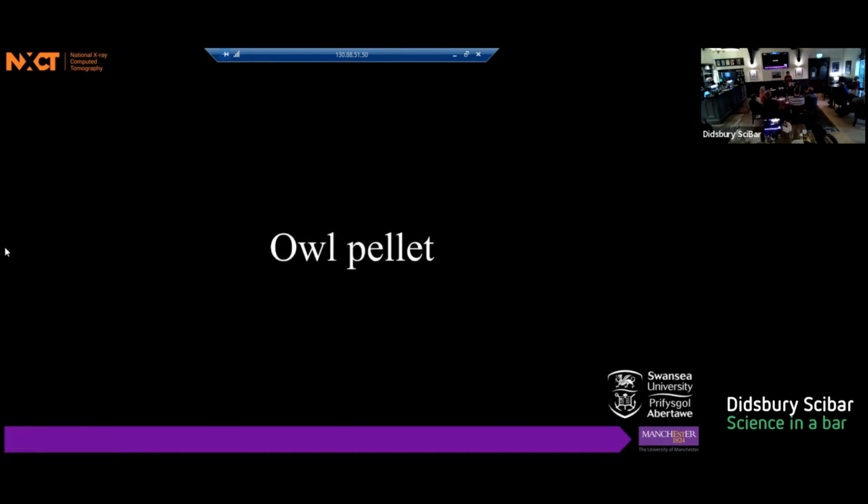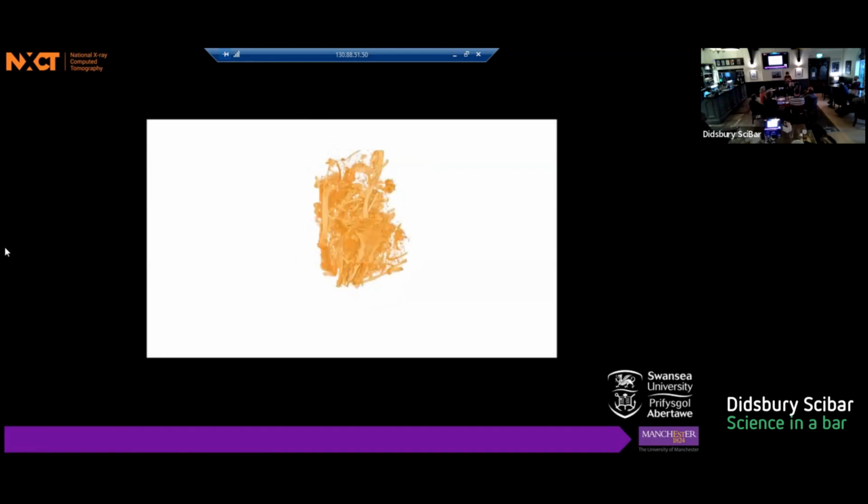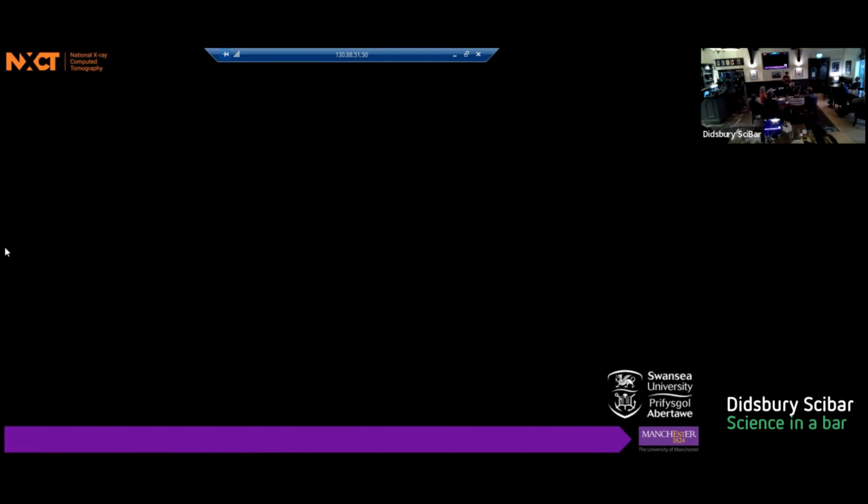So sometimes though, idle curiosity gets the best of you. And I was out walking one time on sand dunes near the university in Swansea, and I happened upon an owl pellet. And frankly, I was delighted because I've always wanted to find an owl pellet. I think it's fascinating. And then I thought, well, the next thing after finding an owl pellet is scanning an owl pellet. So that's exactly what I was able to do. And a lot of naturalists will find owl pellets and dissect them with tweezers and a dish of water and see what's inside. But I thought, well, maybe we're losing some information if we just pick it apart. What if we see the shape of it? Does that tell us something about actually how the owl gets rid of that waste from themselves, shall we say?